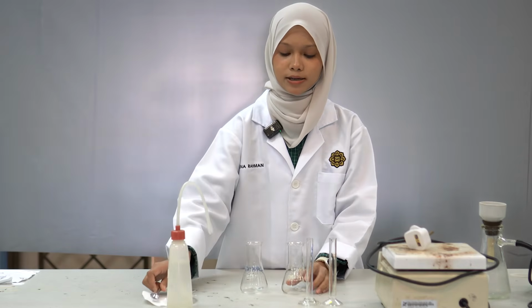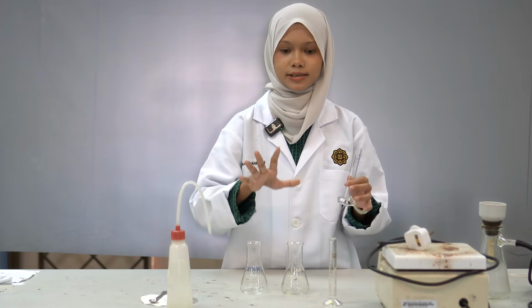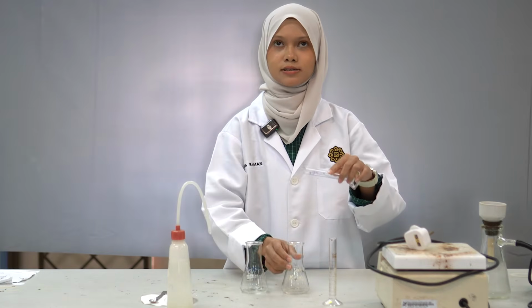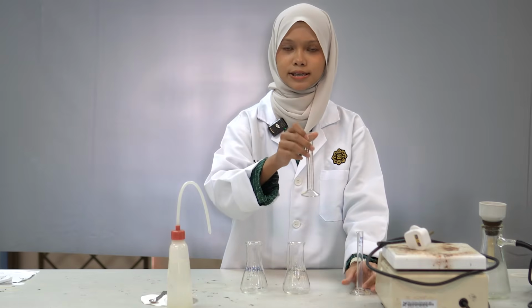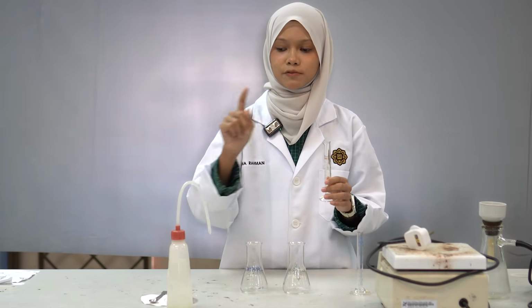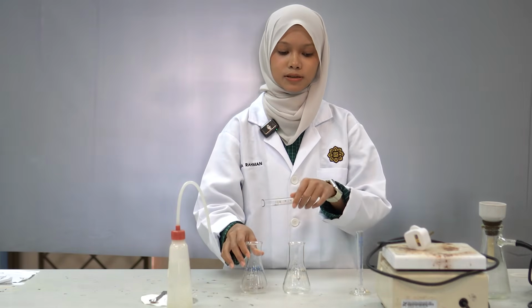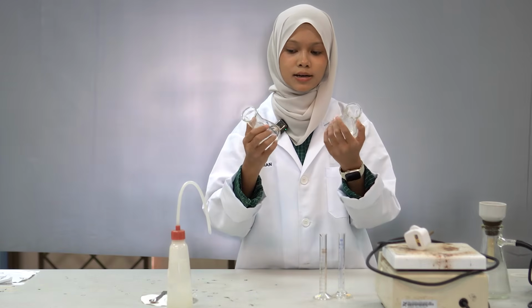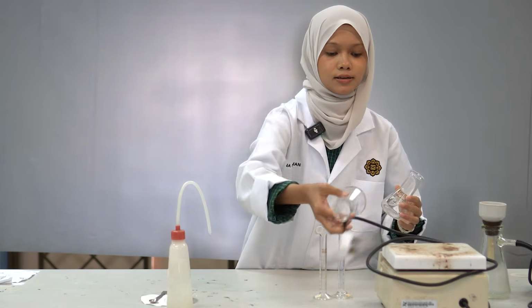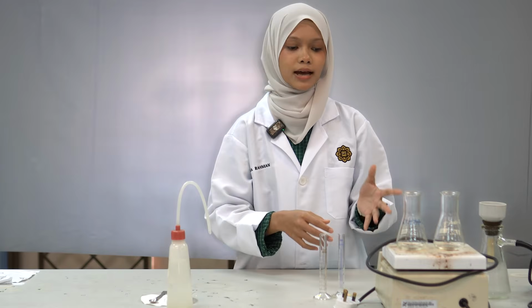And then we are going to measure 5 ml of hexane and pour it into the single solvent flask, and then use the other graduated cylinder to measure 5 ml of water or methanol and pour it into our mixed solvent flask. And then after that, we're going to put both of our flasks on the hot plate and heat them up until they boil.